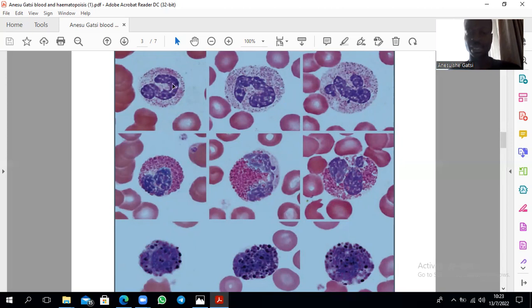So those are the neutrophils. They're the most abundant white blood cell. Right? Diameter-wise, they're about 10 to 12 micrometers. Then they may show presence of a Barr body, which is the inactive X chromosome in females. Right? And that Barr body shows a drumstick shaped appendage here on one of the nuclear lobes.